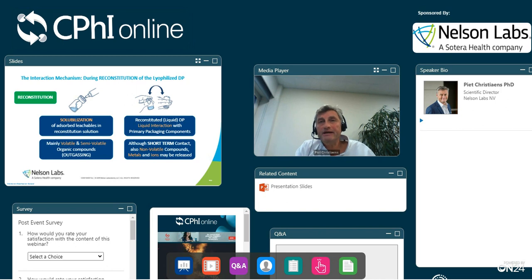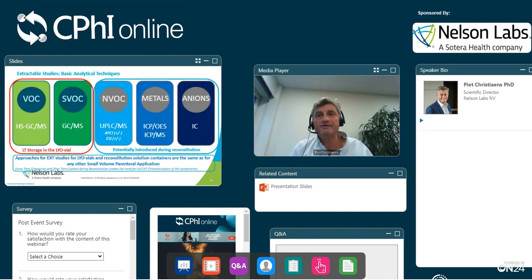So as a consequence, when we look at the techniques that we will use to characterize, for instance, the materials of construction in an extraction study, it will be a combination between focusing on the volatile and semi-volatile compounds with headspace GCMS and GCMS for the primary packaging of the Lyo applications. But also we will need to expand that into the non-volatile compounds, metals and ions, because of that short-term contact of the reconstituted drug product with the container closure system. So at the end, there's nothing really different than for any other small volume parenteral that is aqueous based from an extractable perspective.